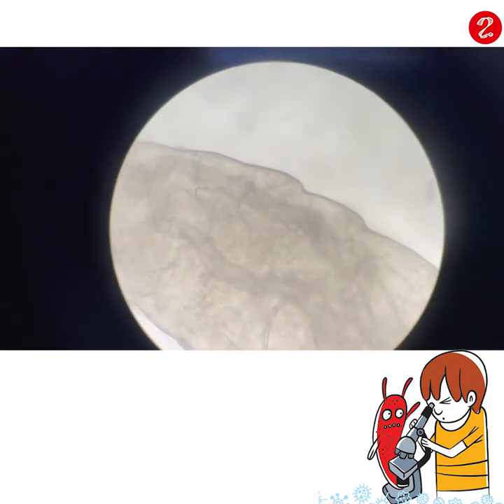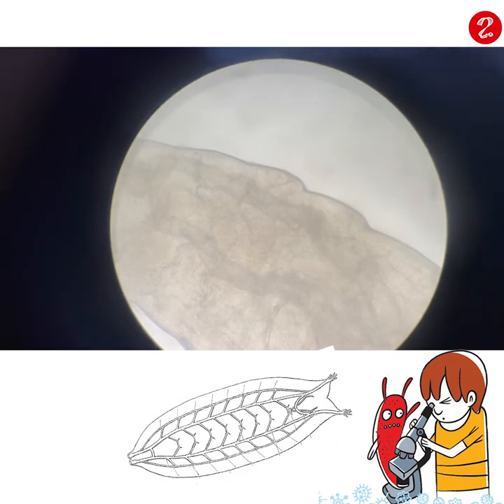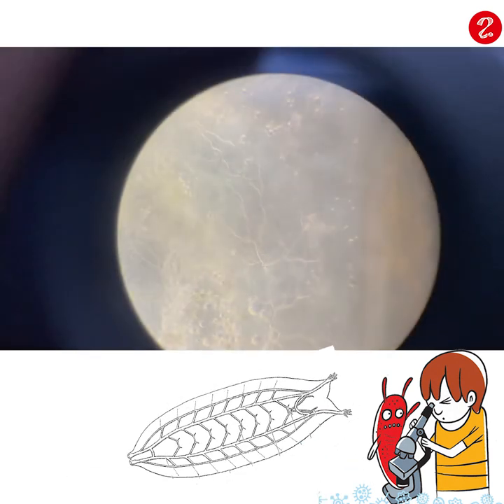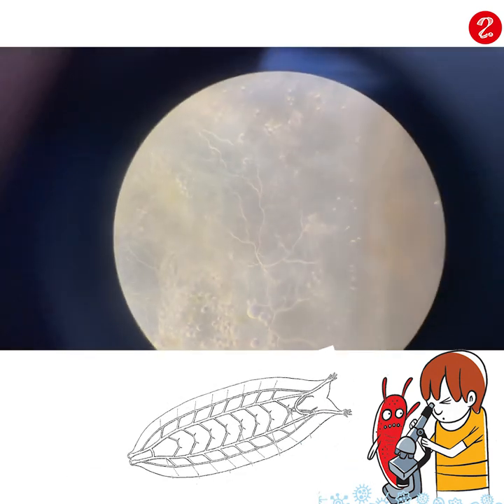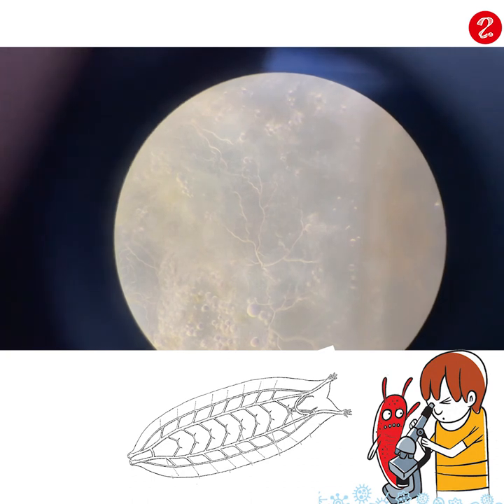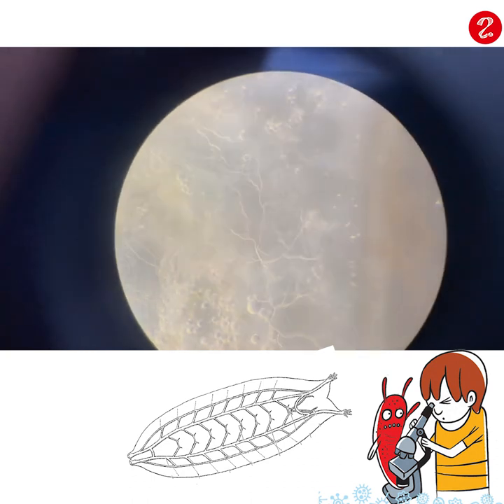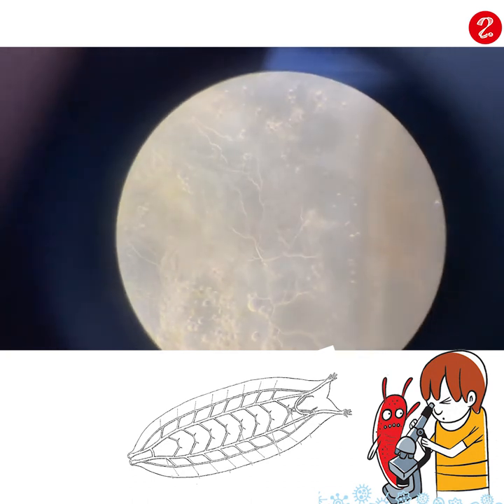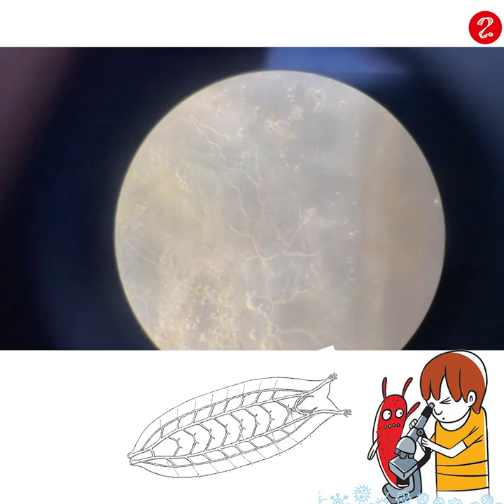This is the tracheal system — a very small tube. This is the air bubble. Here, we can see the air flow.